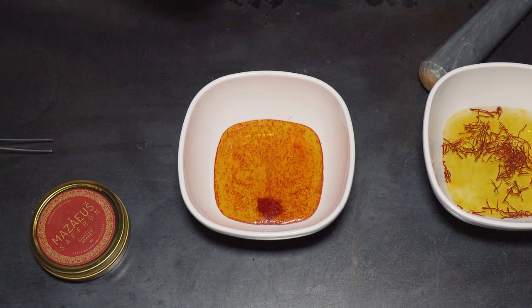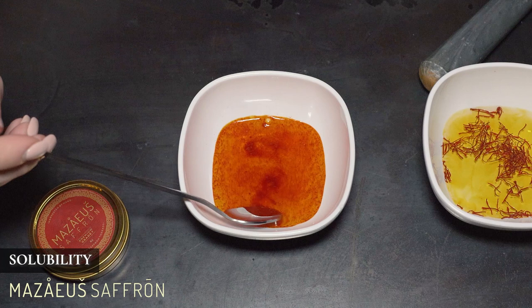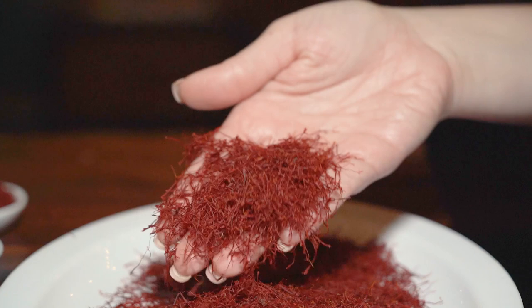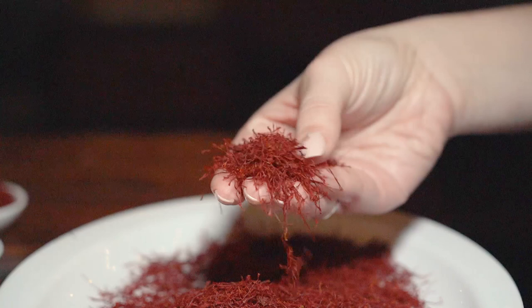Another test checks the moisture content of the saffron. This is confirming that your saffron is not filled with excess moisture, which adds weight. You want to make sure the saffron you're buying has a low moisture content — otherwise, you're paying a hefty markup for water. According to the ISO, properly dried saffron should have a moisture content no higher than 12%.